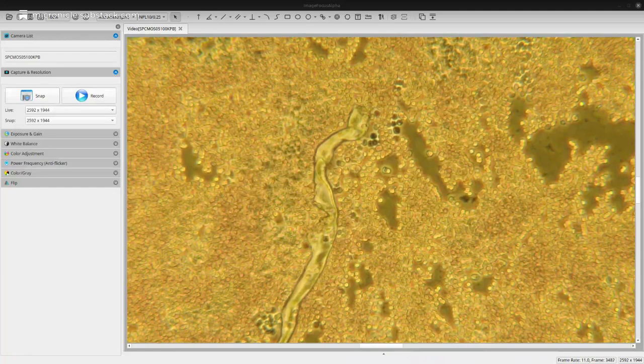I know this wasn't on here the first time. I looked over the whole slide, and there was nothing like this there.